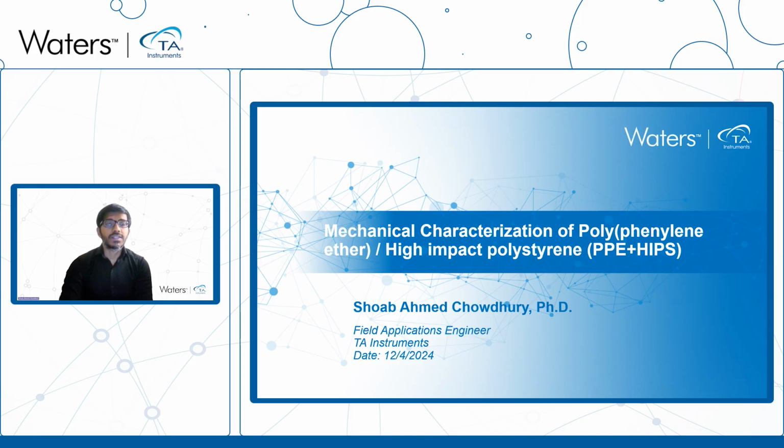Today, I will present mechanical characterization of a polymer blend material, which combines polyphenylene ether, also known as PPE, and high impact polystyrene, also known as the HIPS material. Here, I will refer to the polymer blend as the PPE plus HIPS material. Let's start with the webinar.